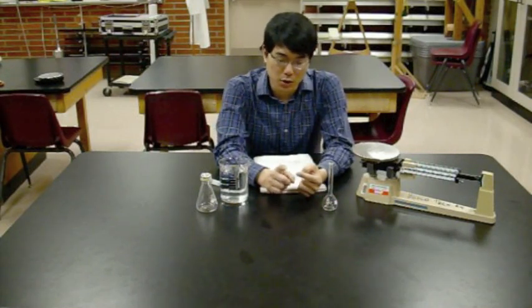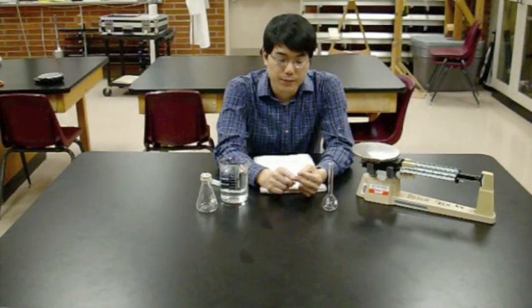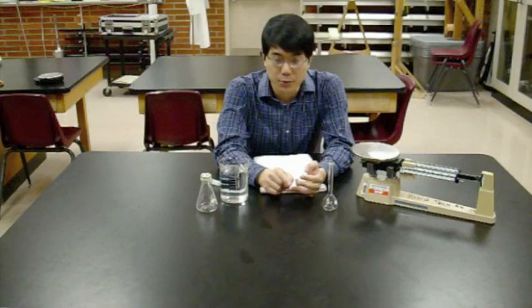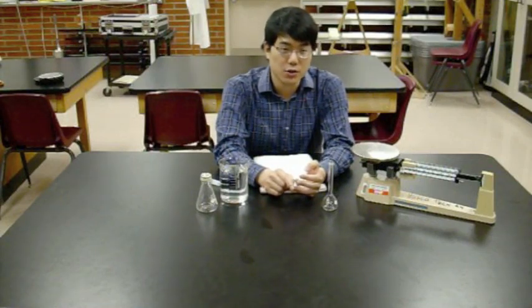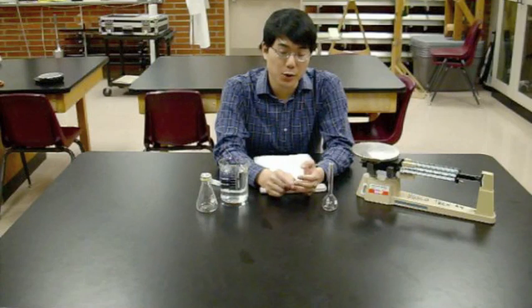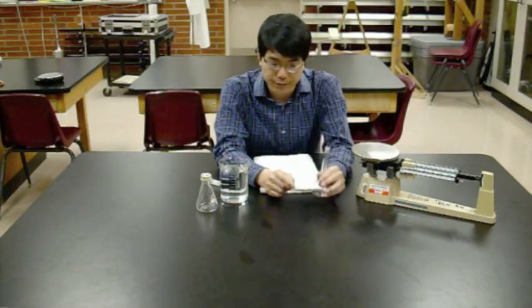The other two are volumetric pipettes and burets. Notice that missing from that list is a graduated cylinder. So graduated cylinders are not considered to be super accurate. Not nearly as accurate as a buret, a volumetric pipette, or a volumetric flask.